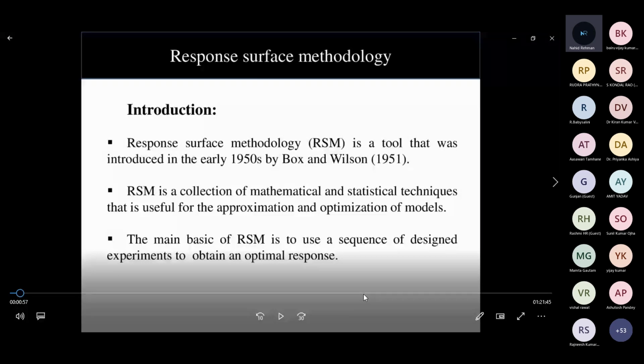So the optimization comes in two steps. First, you optimize the pre-treatment process which liberates the free carbohydrates, so that bacteria can utilize those free monosaccharides for further conversion into hydrogen. And now, how are these achieved? You have two pathways. One pathway says that you optimize each parameter one at a time.